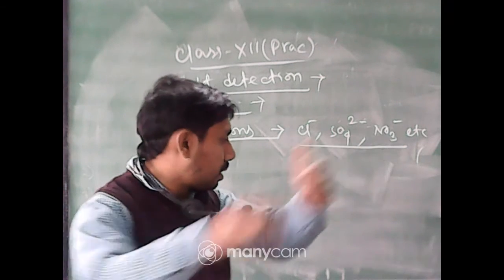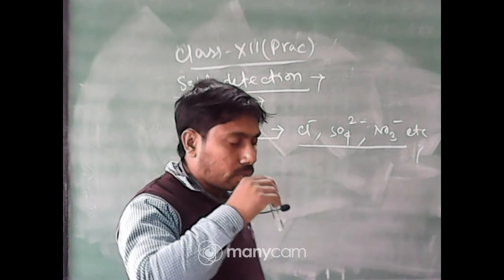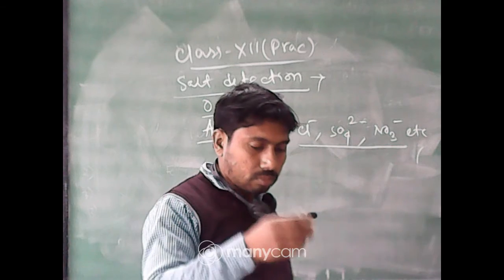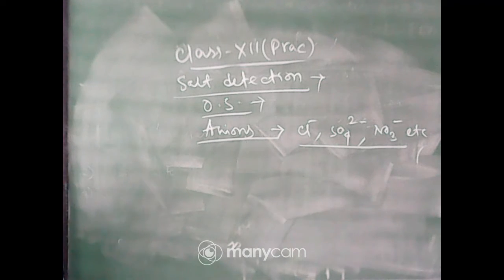As it is acid medium, sodium sulphide will produce H2S gas, which is coming out from the mouth of the test tube, but there is no PPT. Okay.